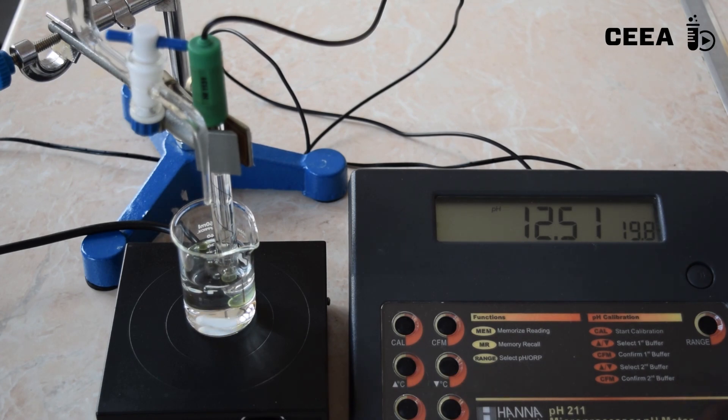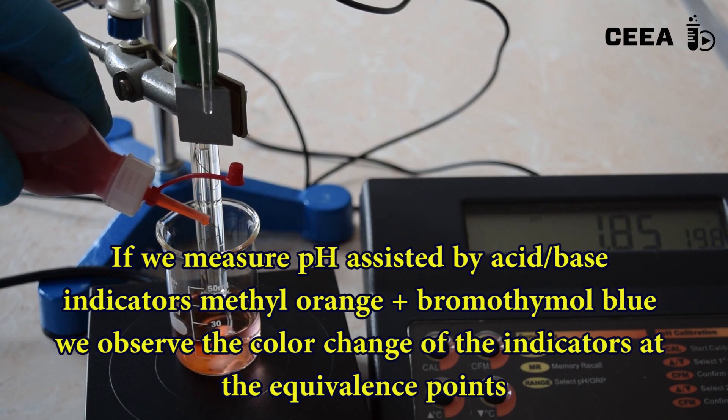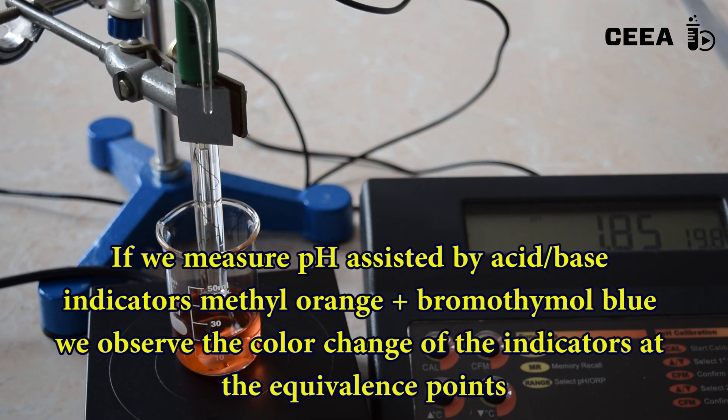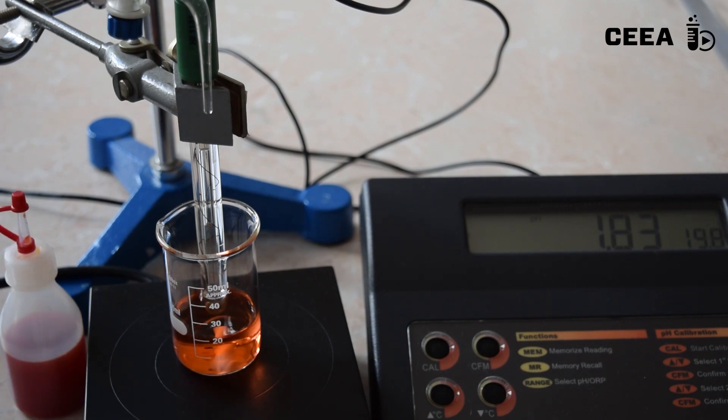If the titration is performed in the presence of acid-base indicators — in this case a mixture of methyl orange and bromthymol blue — we notice the color changes when the pH jumps due to the equivalence points.